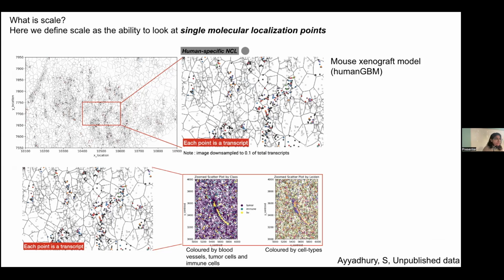We already discussed scale when we talked about spatial clustering. That is also scale, but it's a scale that is screening over a broader region. When your scale becomes bigger, like bulk RNA sequencing, that is also a scale. In this case, your scale is the whole tumor chunk. And how you define that scale will determine the biological output or input that you want to measure or give.